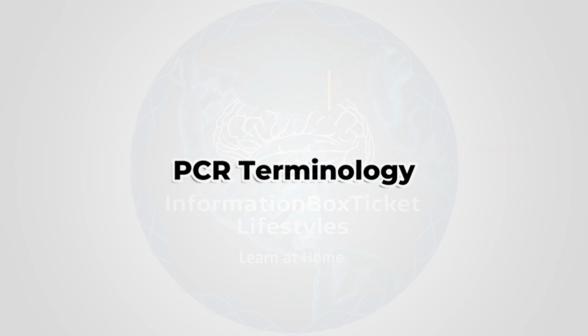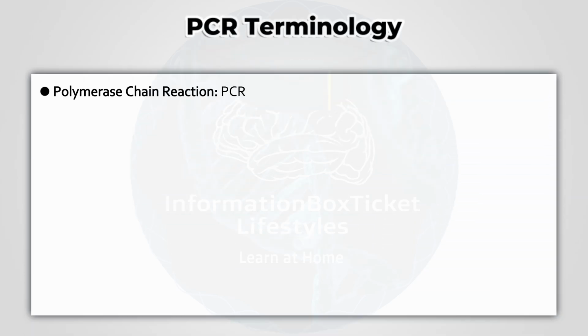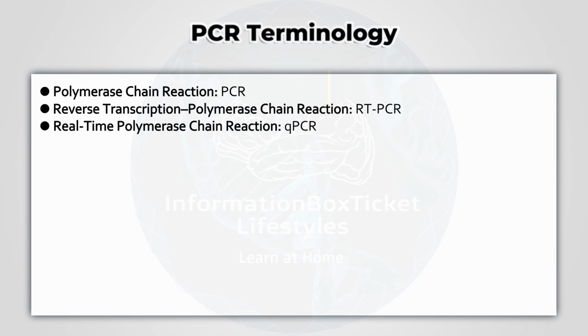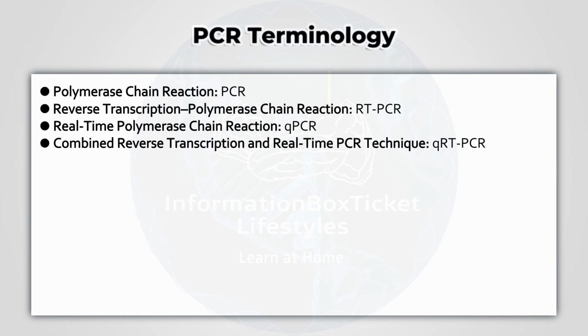PCR Terminology. Polymerase chain reaction, PCR. Reverse transcription polymerase chain reaction, RT-PCR. Real-time polymerase chain reaction, qPCR. Combined reverse transcription and real-time PCR technique, qRT-PCR.